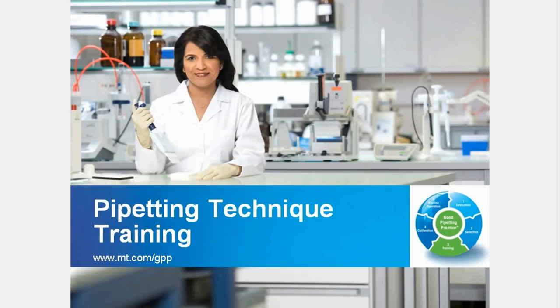Today's course was presented as part of Good Pipetting Practice, also called GPP. GPP is a guideline to reducing the risks in the workflow process that involves liquid handling and maximizing the potential to produce accurate, reproducible data. Good pipetting practice covers a number of individual components that can be considered individually, but when taken as a whole will lead to improved data generation. Today, we just talked about good pipetting technique, but there is a lot more to pipetting than just that, which we would also be glad to tell you about.